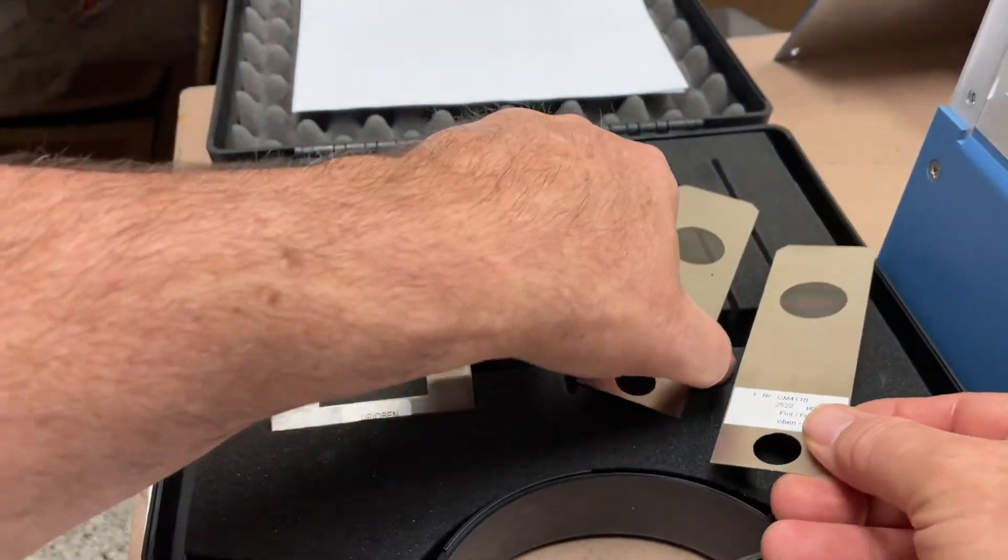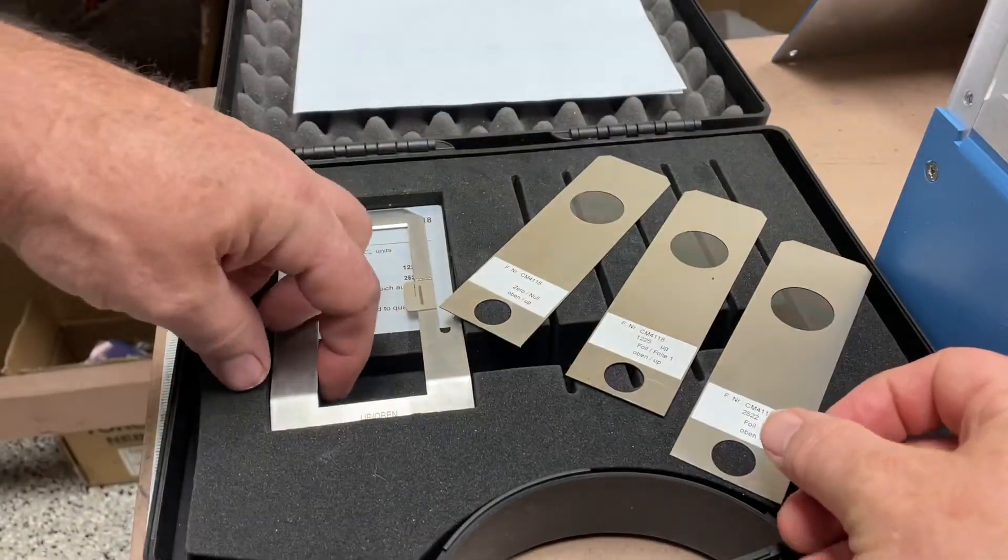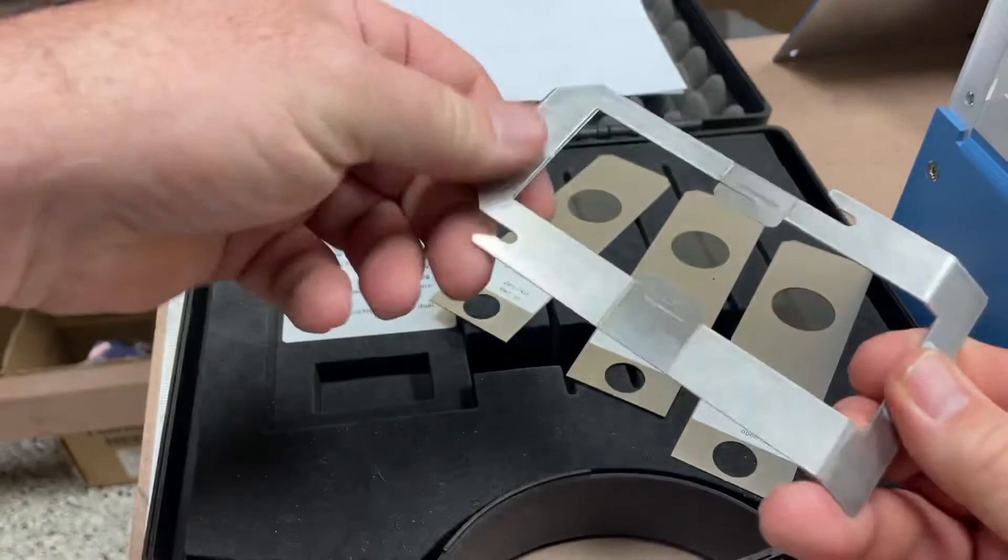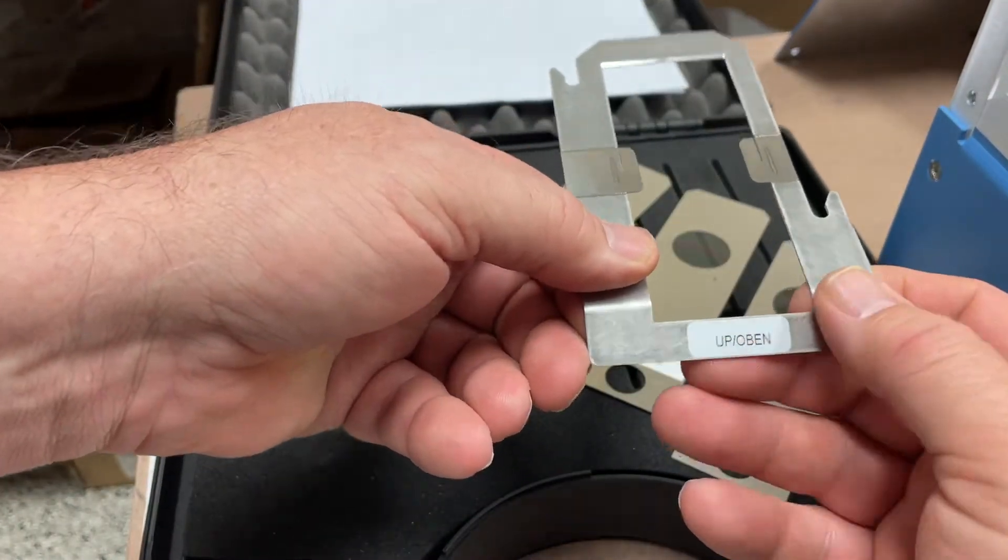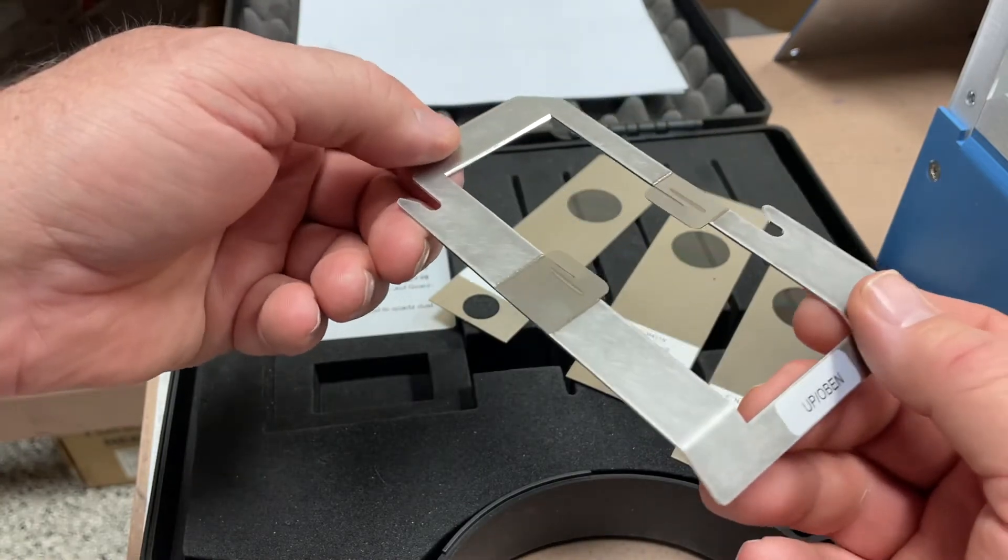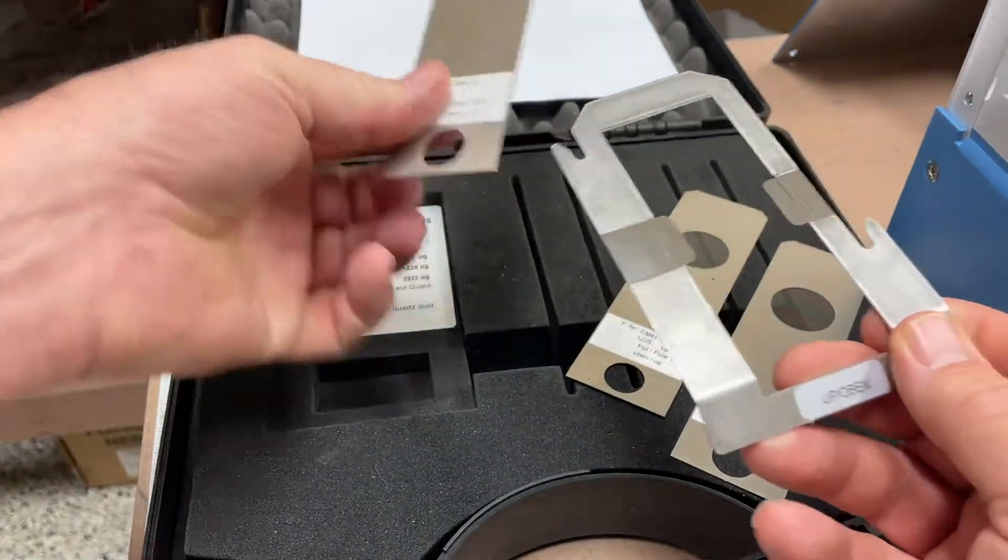These are the three foils that come in this kit, and it comes with this little bracket. On this bracket it says 'up,' so this means it needs to be positioned up in the detector.